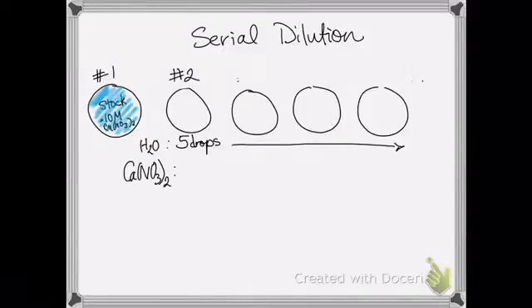Everyone, welcome to a little pre-lab video just to get you started on your Ksp solubility product constant guided inquiry experiment. In this particular experiment, the objective is to determine the solubility product constant for an ionic compound.